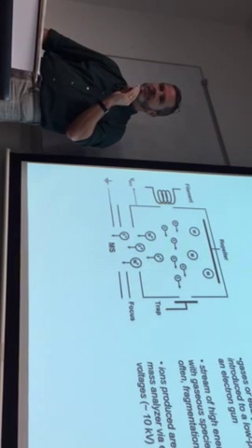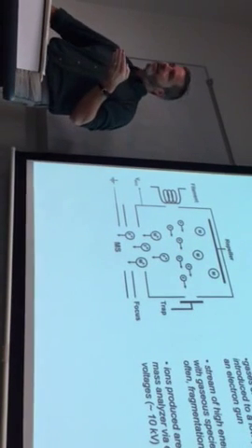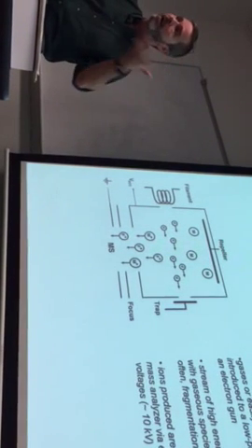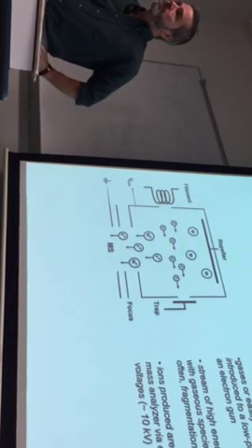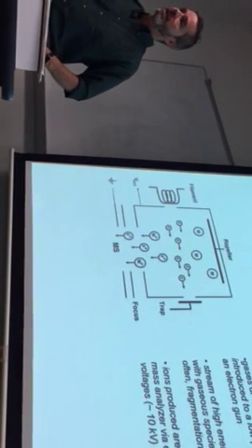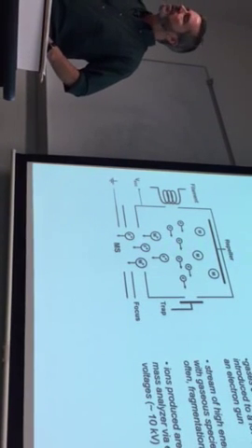Yeah. Excellent. Did I make an analogy that spoke to you? Are you recording this? Yes. Did that analogy speak to you? Don't get me down into the nitty-gritty physics, because that is beyond my knowledge base. But that's the way I've always thought about it. And I see why they called it electron impact. Originally it was thought that the electrons actually have to collide, but no, they don't have to collide. And how was that determined? I don't know. I'm ignorant of the history, I'm sorry.